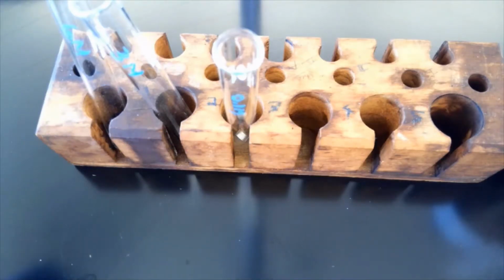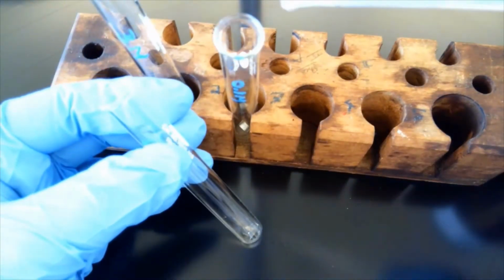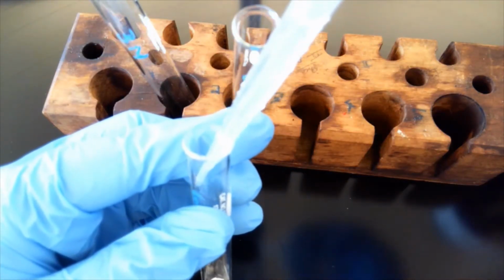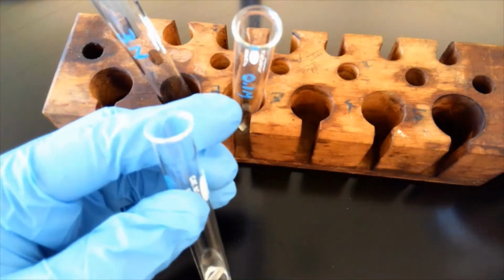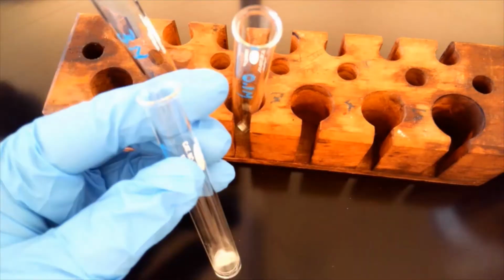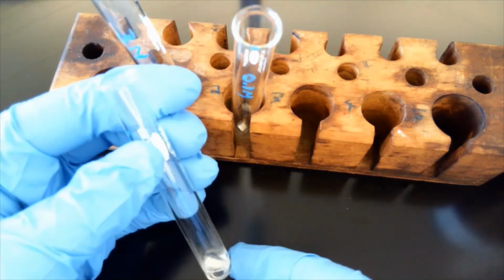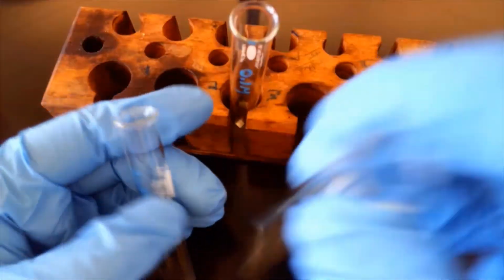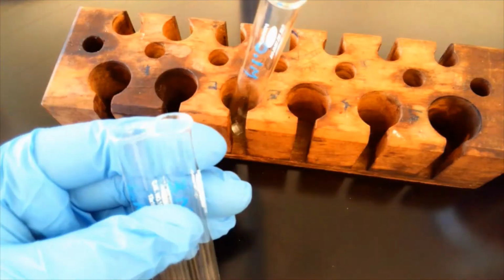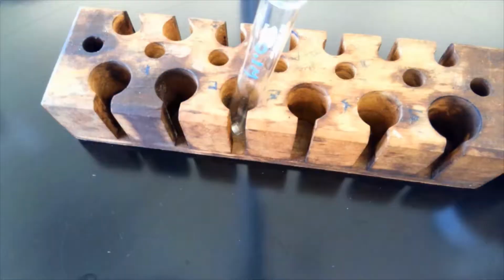So we're going to add a little bit of the 6 molar acetic acid into this and see how it reacts. So as you can see, it's starting to move. It's a very strong vinegar smell, but you can see the bubbles and you can see a little bit of the gas forming, and the bottom is actually getting hot. So while that's moving, we're going to go quickly, and you can now see what's happening with the 3 molar acetic acid.